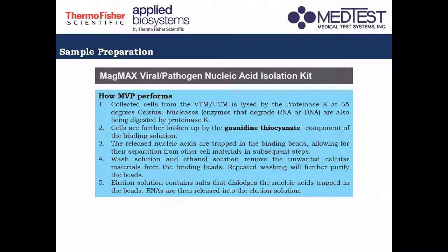So the next thing is that once the contents of the cells are released, the binding beads incorporated in your process will trap the RNA.